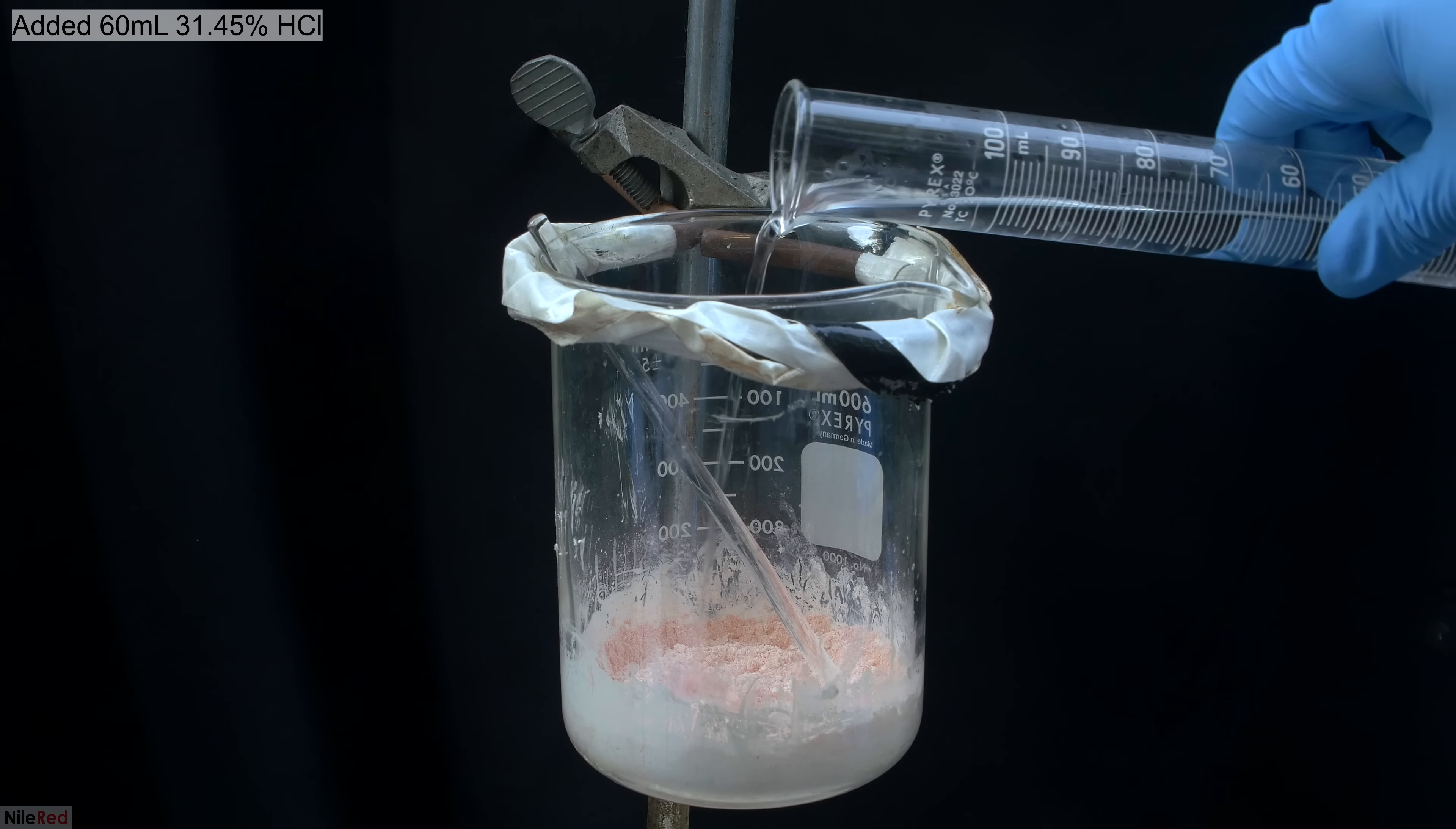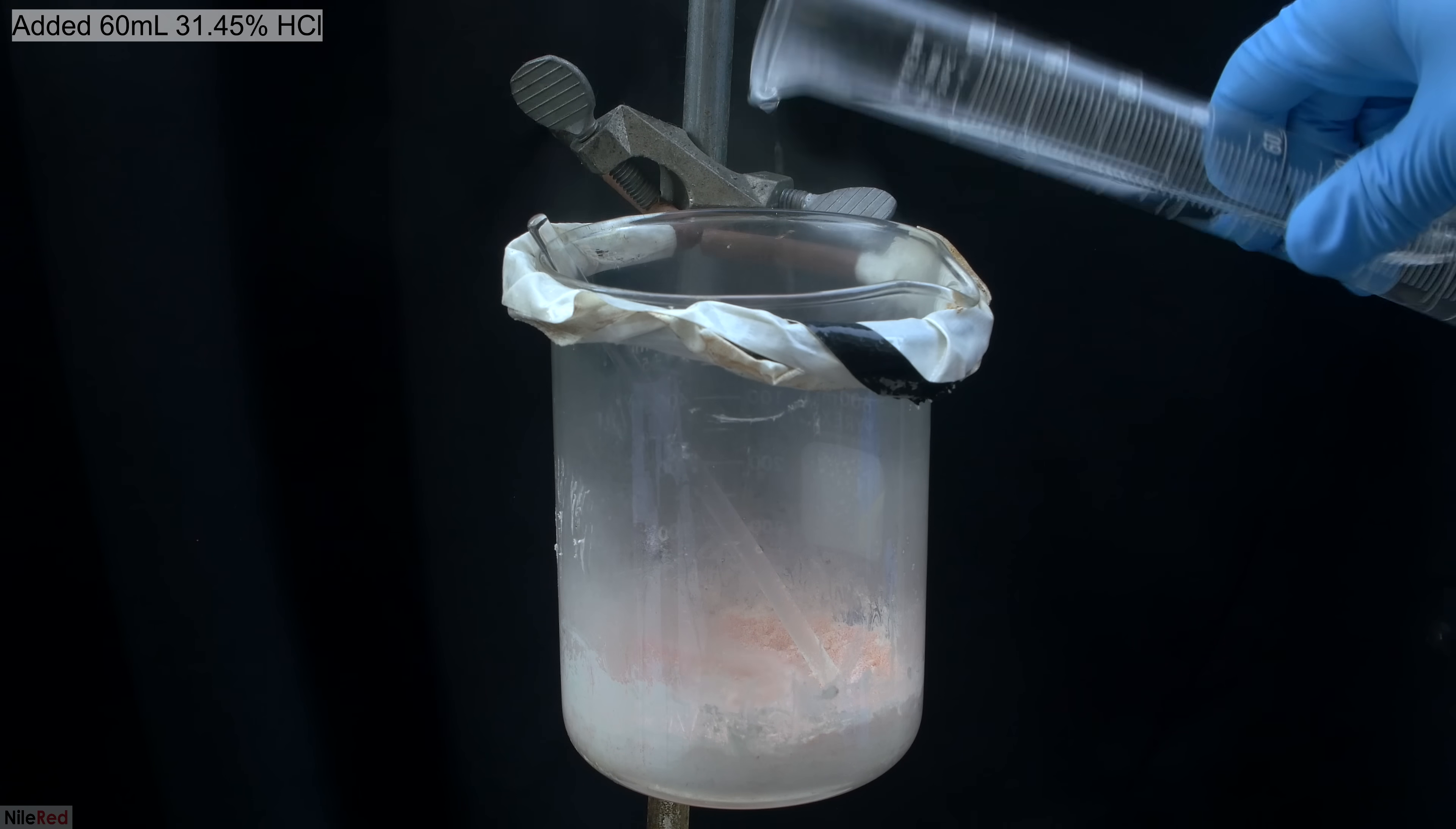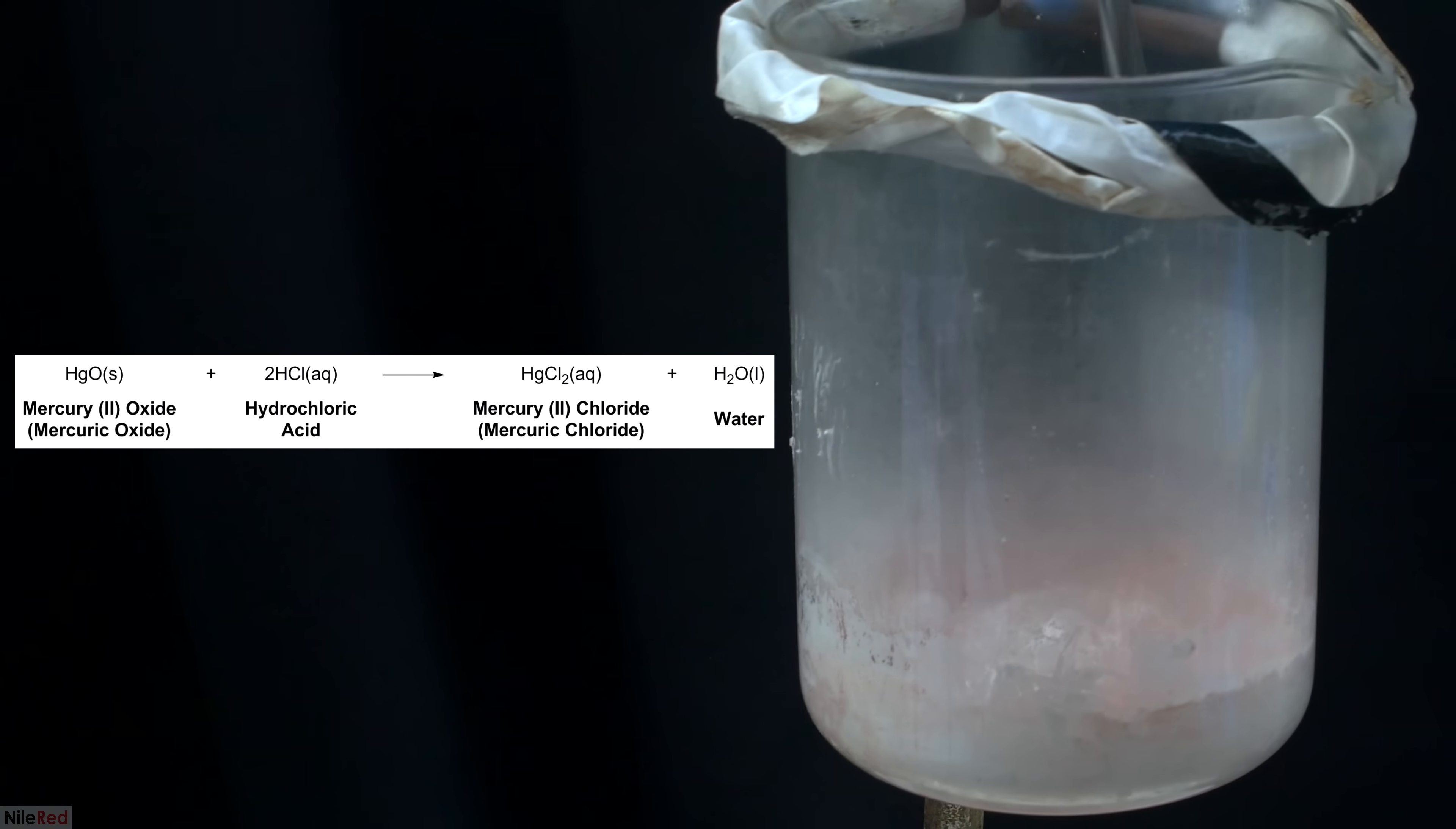Things were allowed to cool down a little bit, and then I added 60 milliliters of hydrochloric acid. The hydrochloric acid reacts immediately with the colored mercuric oxide to form colorless mercuric chloride. I added the hydrochloric acid in small portions with stirring in between, but there wasn't a huge reason for doing this, and it probably could have just been dumped in all at once.